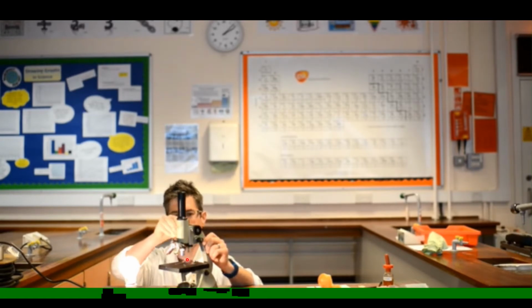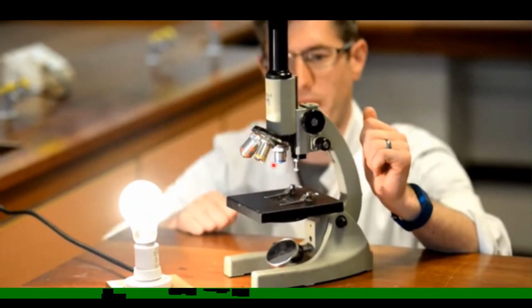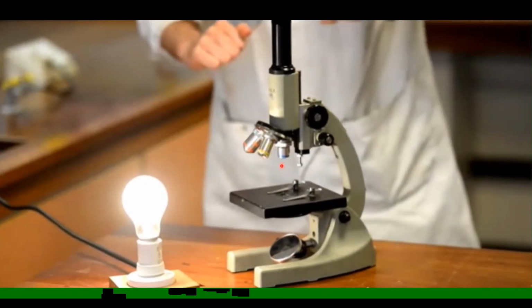And first you have to use the low power of the objective lenses in observing a specimen.